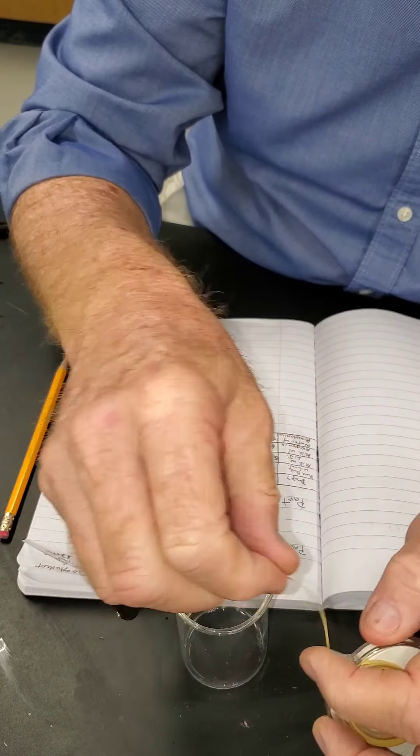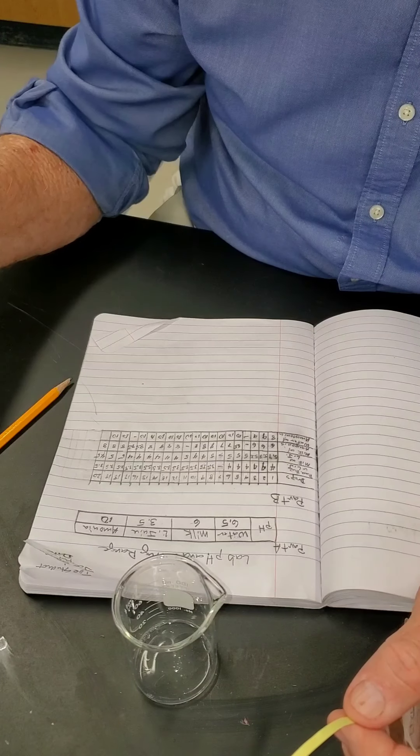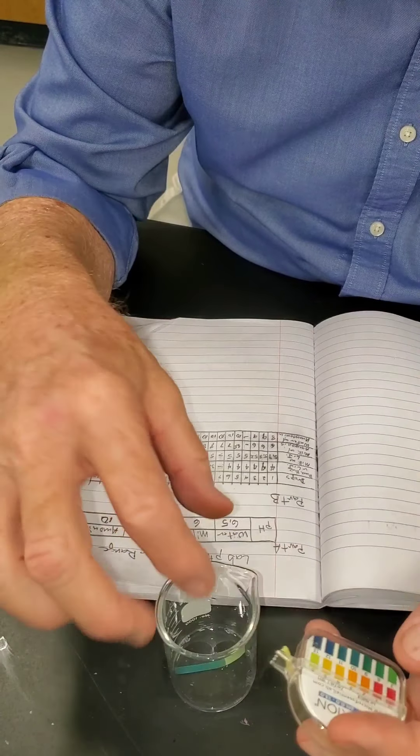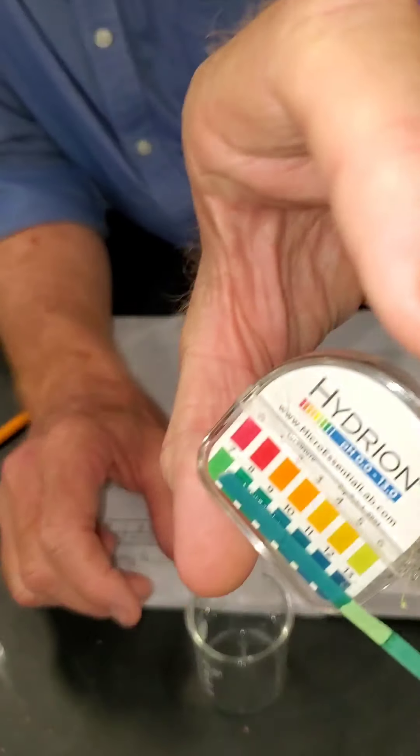Still a 10. Two drops to go — let's not mess them up. One drop, swirl for 10 seconds, pull out the pH paper and check it. If you want to guess, you got it right — it's a 10. One last drop, swirl, one last test. Careful not to leave the pH paper in too long or it will leach out. The last one: 10.